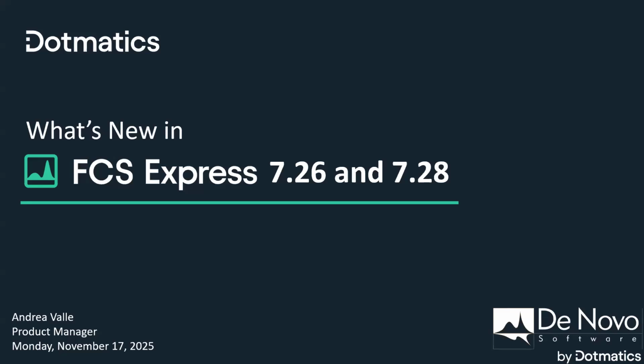And today in this webinar, I want to show you a few new things that we introduced in 7.26 and 7.28. 7.28 has been released a couple of weeks ago, on October 29. So if you didn't update yet, then feel free to navigate on our website and download it.